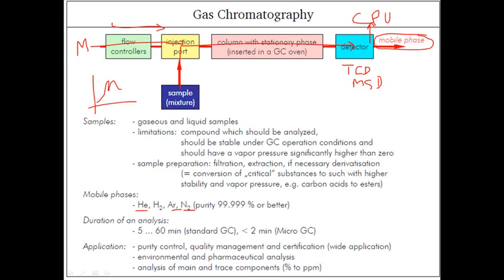And remember, each time we run a chromatography, after the run, we have to clean this column, because we need to have a column which is free of any kind of molecules from the previous experiments. Okay, that's why we need to have a clean column every time.